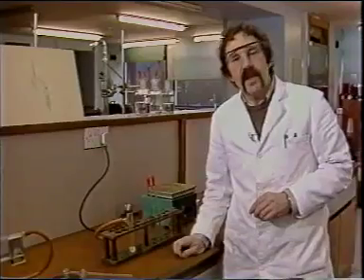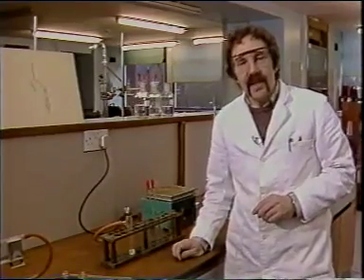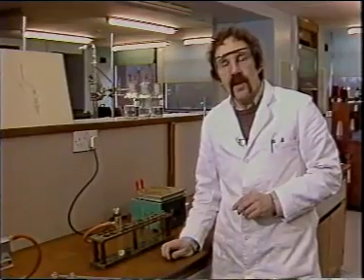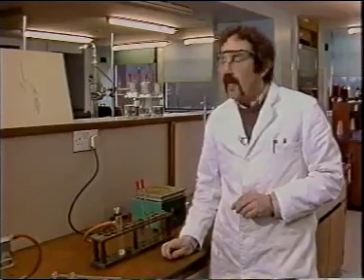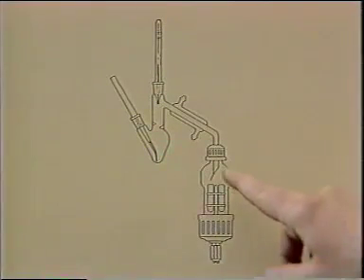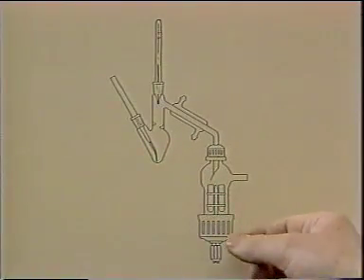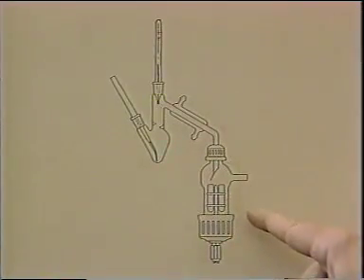When it comes to distillation of small quantities of liquid, one of the problems is that liquid is held up at each of the joints in the conventional quick-fit apparatus. In the diagram here, ingeniously, the joints have been avoided, and as a result, we can carry out distillation from this flask and collect several fractions by rotating this base in this all-glass apparatus.